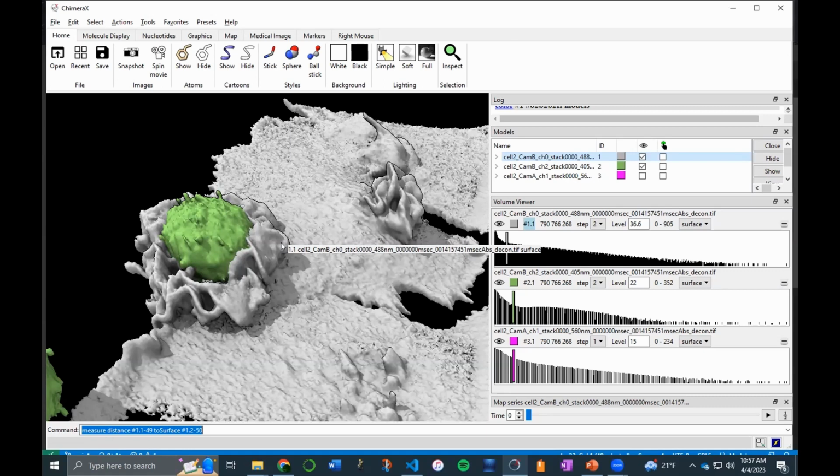Actually, this one's not built in. I wrote this as a package into Chimera. So yes, all of the data, each vertex has an associated intensity, and we put multiple metrics on each vertex, depending on if it's this intensity or the distance that the vertex traveled.